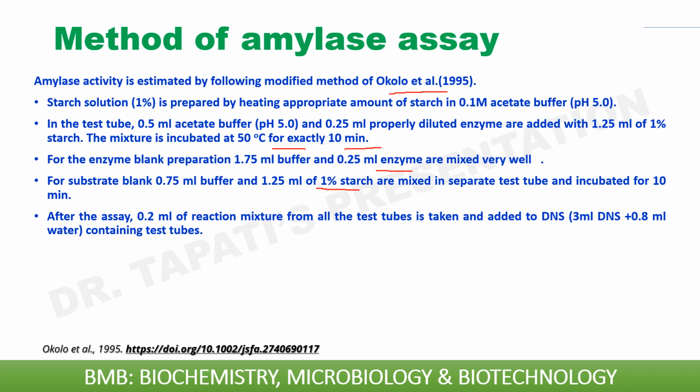Now after the assay, after 10 minutes of incubation, 0.2 ml of reaction mixture from all the test tubes, this one and the enzyme blank and substrate blank, is taken and added to DNS solution containing 3 ml DNS and 0.8 ml water, because in the standard curve of maltose, we prepared 3 ml DNS and 1 ml of maltose solution, and then we heated that.